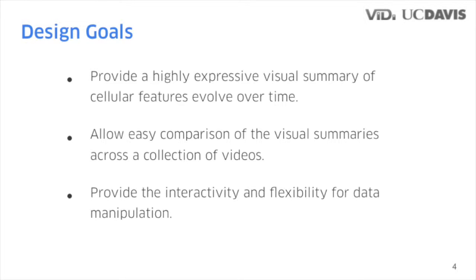Last, scientists usually need to arrange the data in a certain way to verify their hypothesis. They may also want to explore more possibilities to discover new patterns. So it is crucial to support interactive operations for data manipulation, such as sorting and filtering.